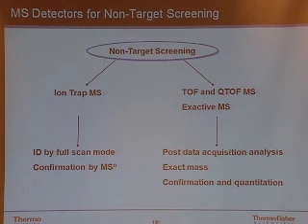Okay, 1 millimass unit. Now, if you had a mixture of 100 pesticides, for example, and you screen them on a time of flight, and you look at mass, any mass in that spectra, then typically what we find is we get about 8 positive identifications, 8 candidates of pesticides, because you only know the molecular weight to the nearest 1 millimass unit.